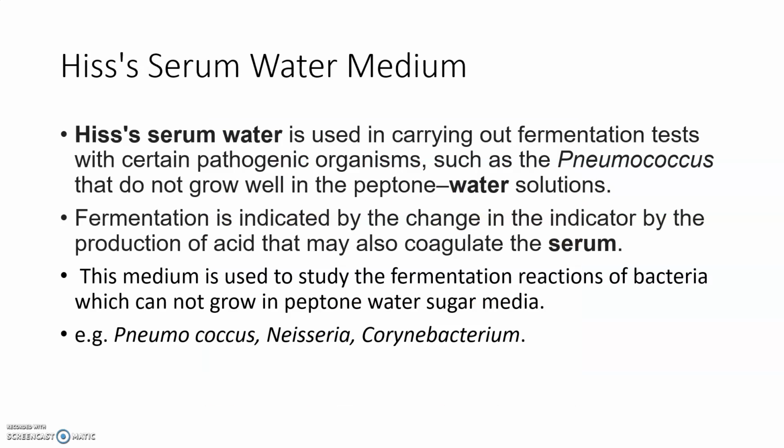So we can discuss the continuation of the important culture media which are used in the microbiology laboratory. So the next culture medium is Hiss serum water medium.